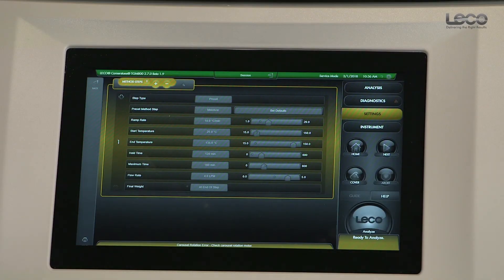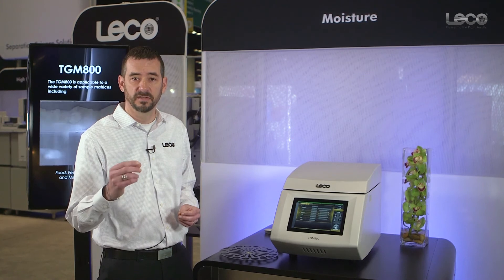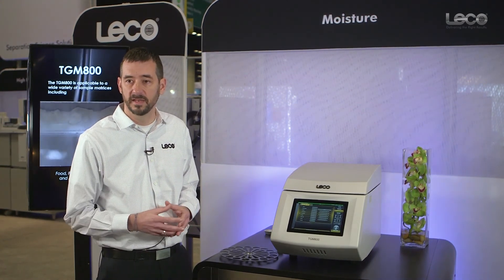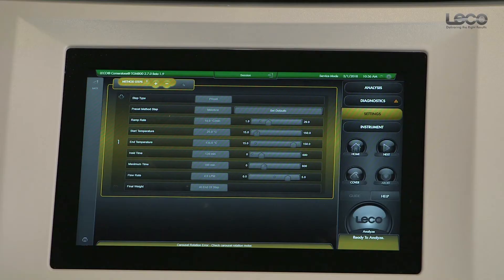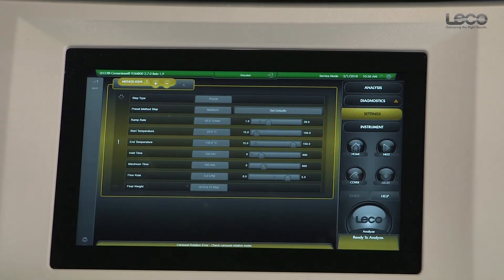We can also set method settings based on sample mass constancy. That's a big advantage for the TGM because not only are we ensuring that samples are dry at the end of the analysis, but we're also optimizing our drying time based on when the sample is actually dry — optimizing throughput as well as ensuring accuracy.